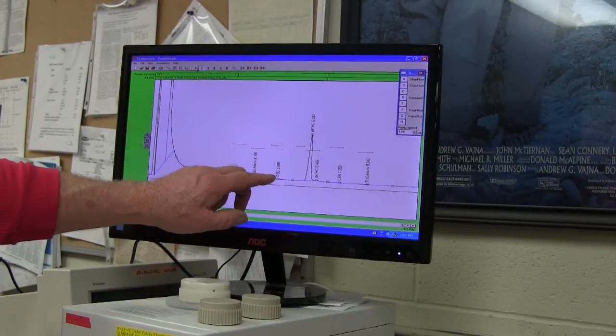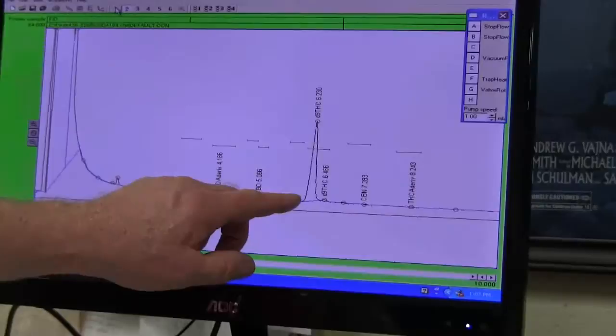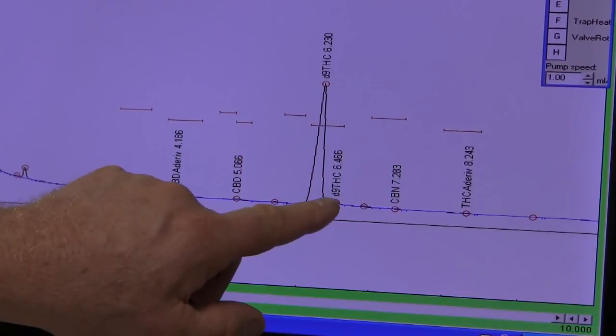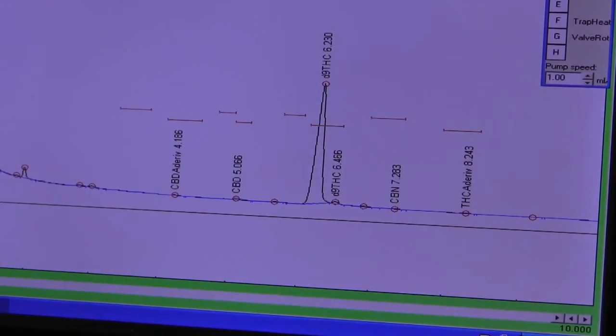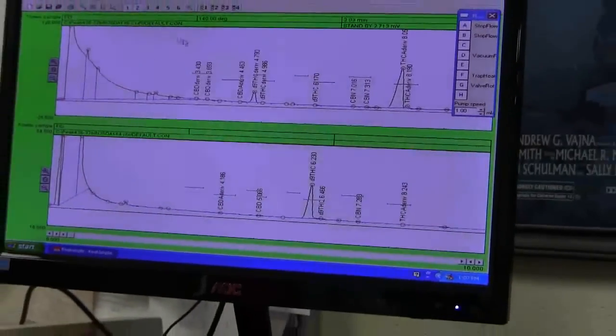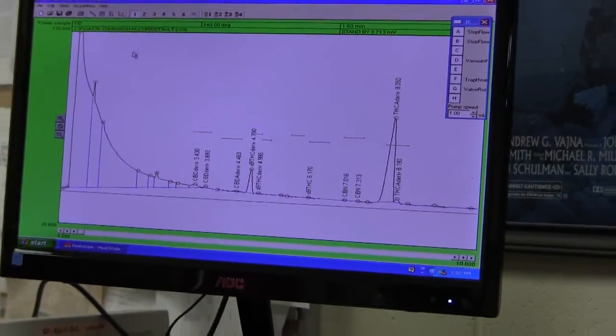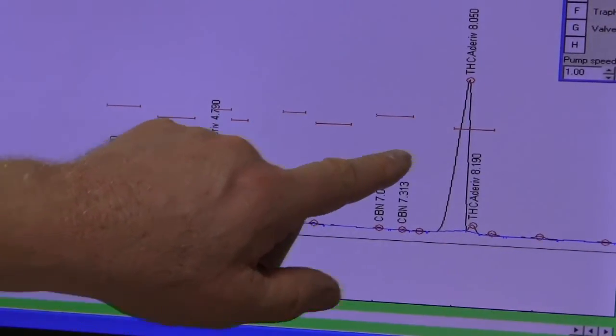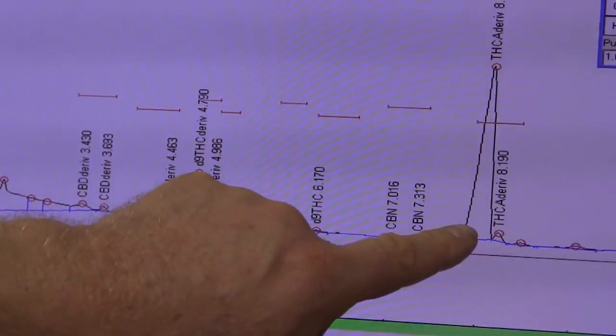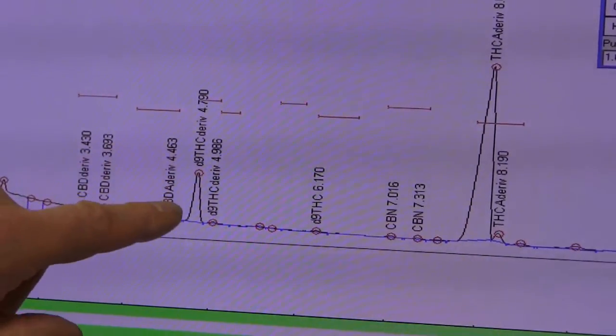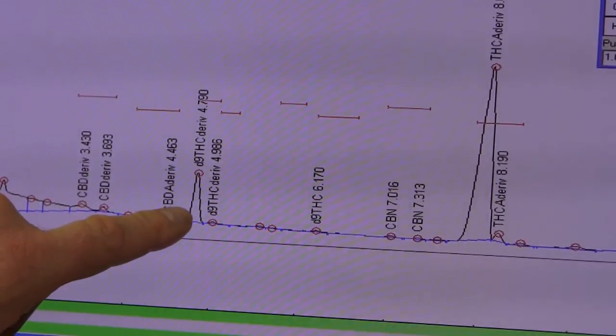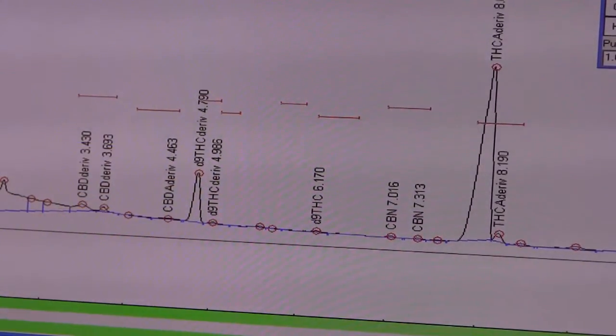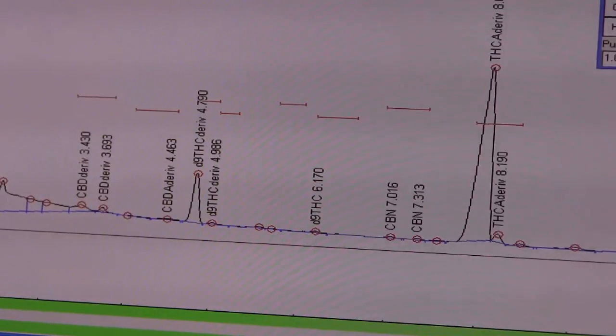So injecting the underivatized cannabis extract, you can see that we get a very large delta-9 THC peak with a small amount of CBD, CBG, and CBN. Now when we do the same sample but derivatize it, you can see that now there's really almost no delta-9 THC, but instead we have a large THCA derivatized peak and a smaller delta-9 derivatized peak. So you can see the ratio of the THCA to the delta-9 that was present in the fresh cannabis flower extract.